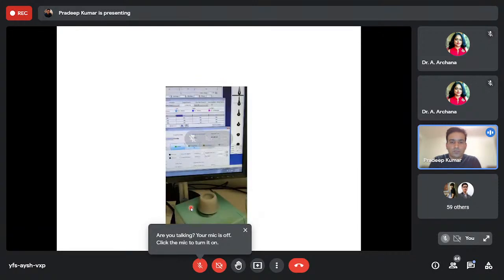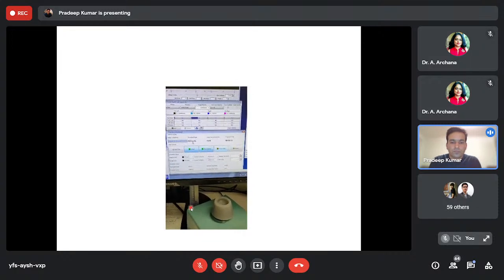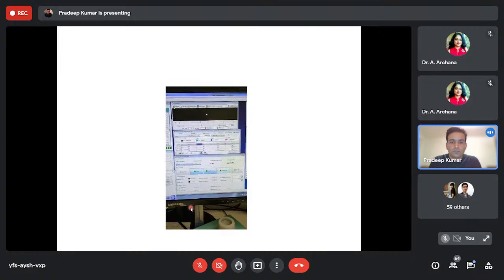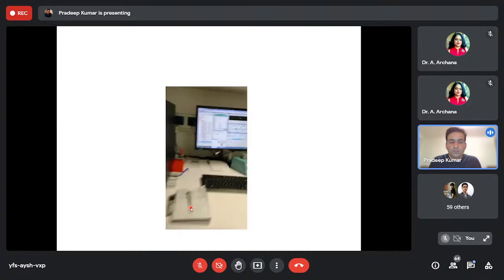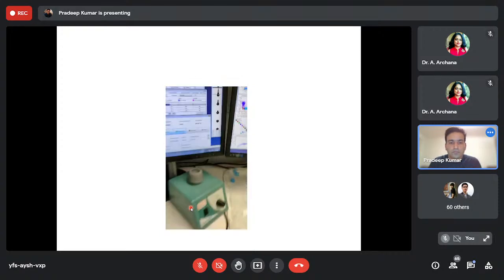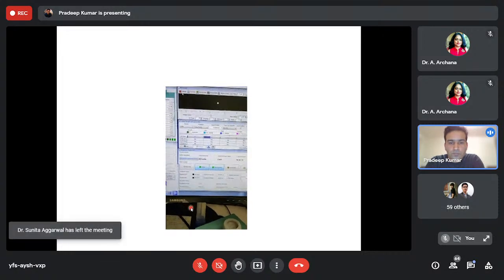Okay, so I'm going to give the command acquire. It will start splitting again, and you will see the number of cells per second flowing through the instrument. And then I put the voltage on the deflection plate. Just hold on a moment. Sorry. Then I'm going to give the instrument command to start sorting the cells.